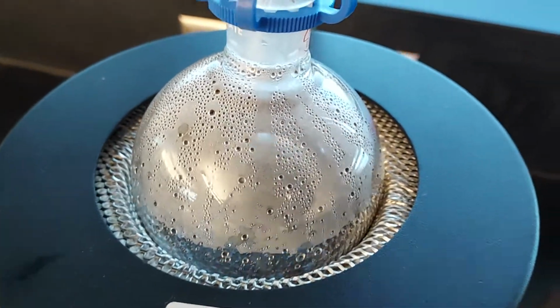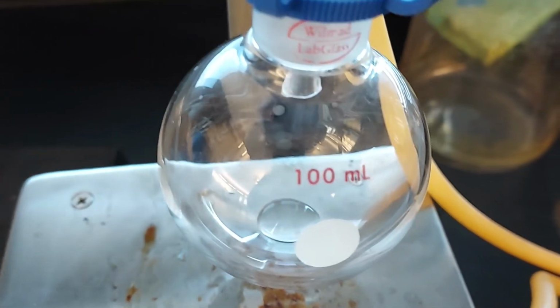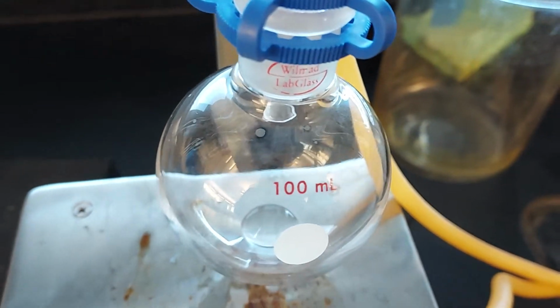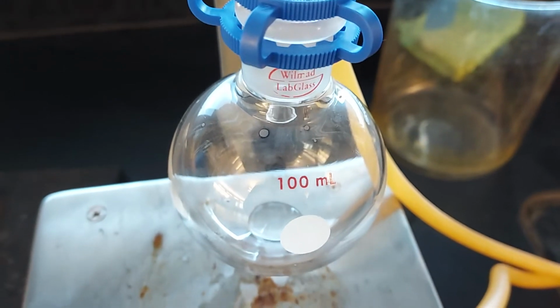So we took Coca-Cola, which is a mixture of a lot of different things, but a lot of water, and we're separating the water physically from the rest of the mixture. So here we'll have that fine, pure H2O that Dr. Velo can drink and still feel good.